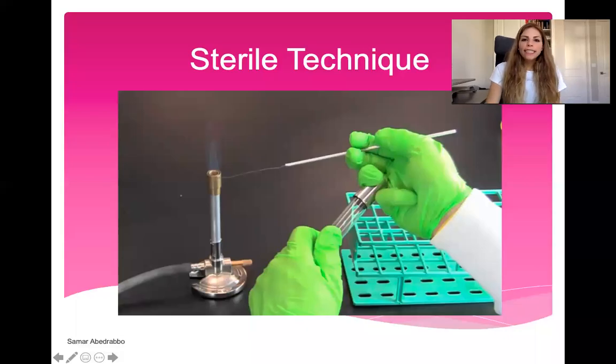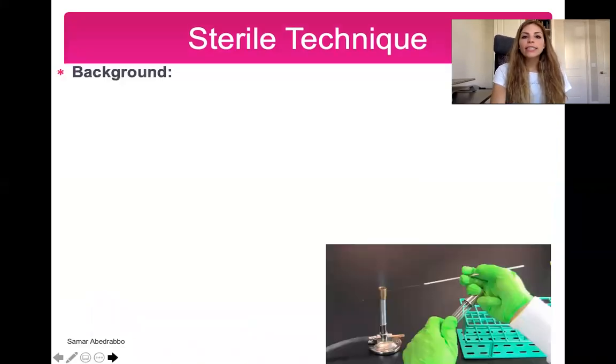Hi everyone. This lab is about sterile technique. So we're going to learn just about the theory behind sterile technique. Sterile technique is a very important method that all scientists, not just microbiologists, use.